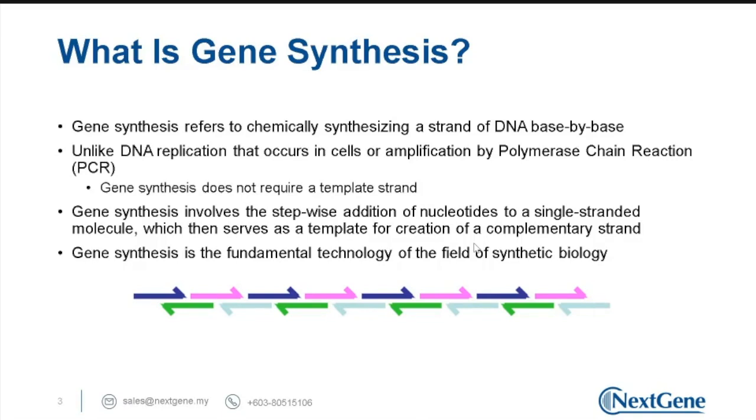Gene synthesis involves the stepwise addition of nucleotides to a single-stranded molecule, which then serves as a template for the creation of a complementary strand. Gene synthesis is actually a fundamental technology in the field of synthetic biology.